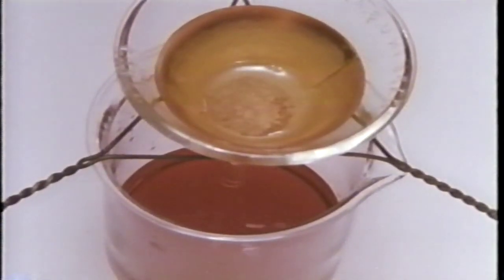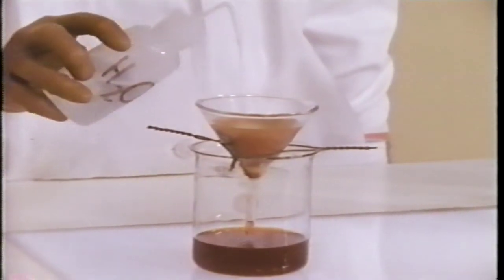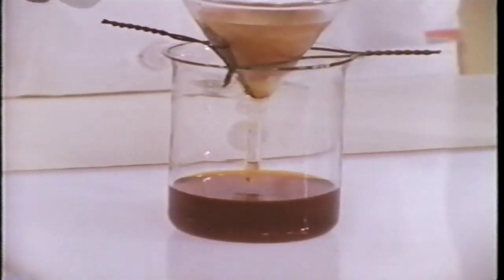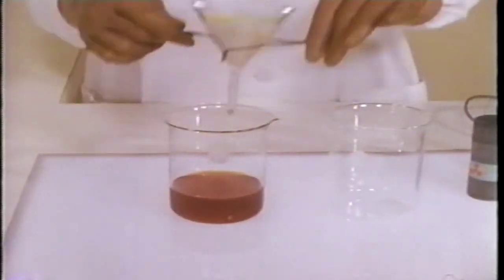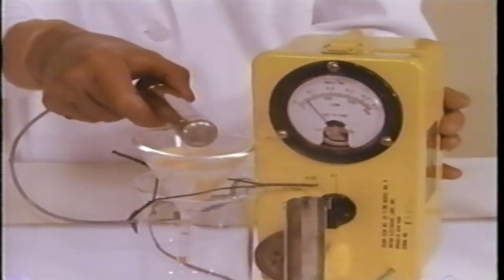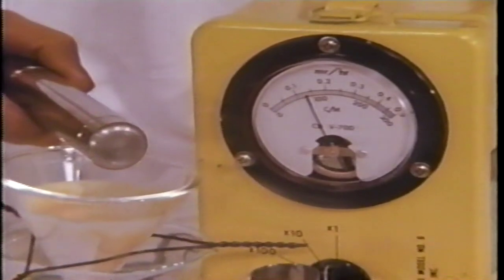Before we can check the precipitate for radioactivity, it must be freed from the liquid, which we know contains radioactive I2 molecules. When the filtration is complete, the precipitate is washed to remove the last trace of the radioactive iodine solution. Now the dry yellow precipitate of lead iodide can be tested for radioactivity. Yes, there is radioactivity in the solid lead iodide.